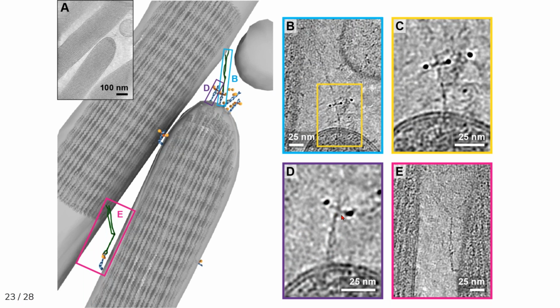This again is an interesting finding, and it's a bit unclear what this really means. Does that mean that multiple copies of protocadherin-15 exist there, but only one of them participates in a tip link, and the others are a reservoir for regeneration? Or it might be that, again, this sample was damaged somehow during preparation, and only one of the tip links survived.